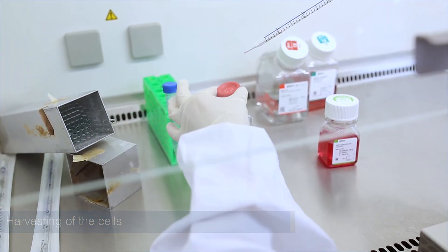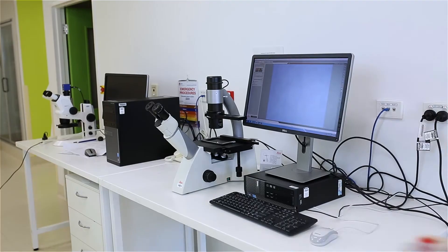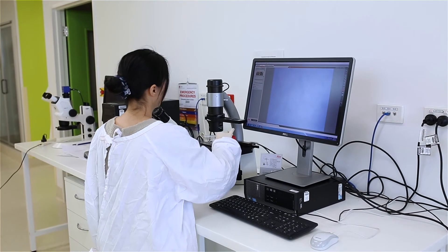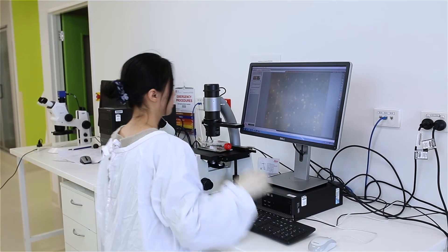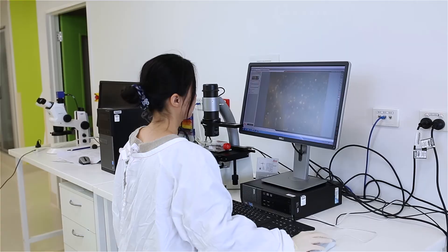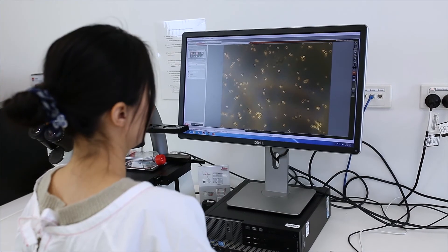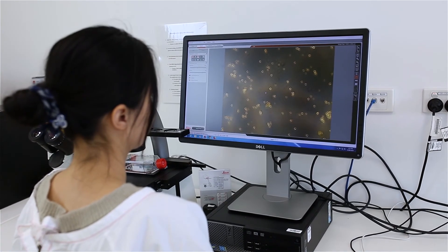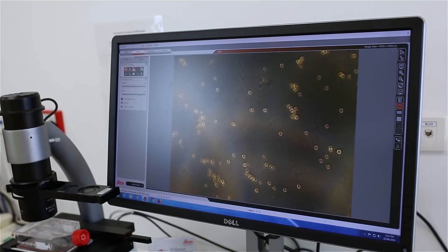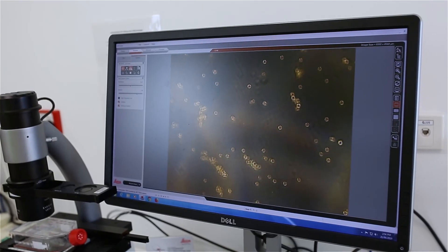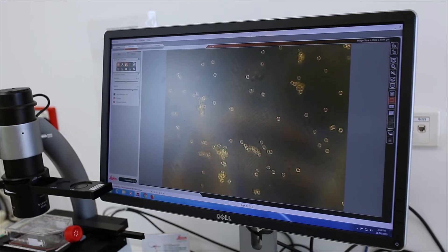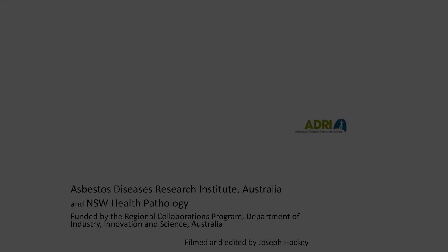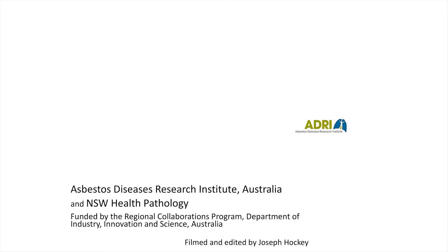The harvested cells can then either be collected and cryogenically stored in a cell biobank for future use, diluted in fresh growth media and transferred to a new culture vessel for continued growth, or they can be transferred to a culture plate for downstream drug treatments.